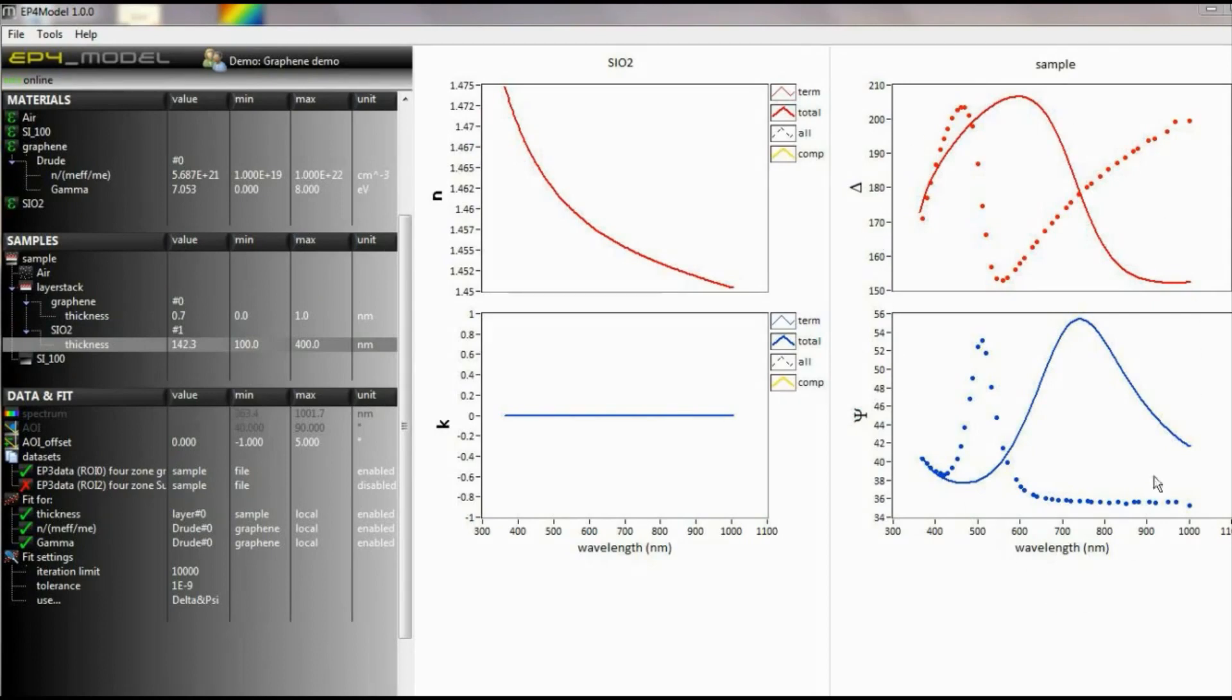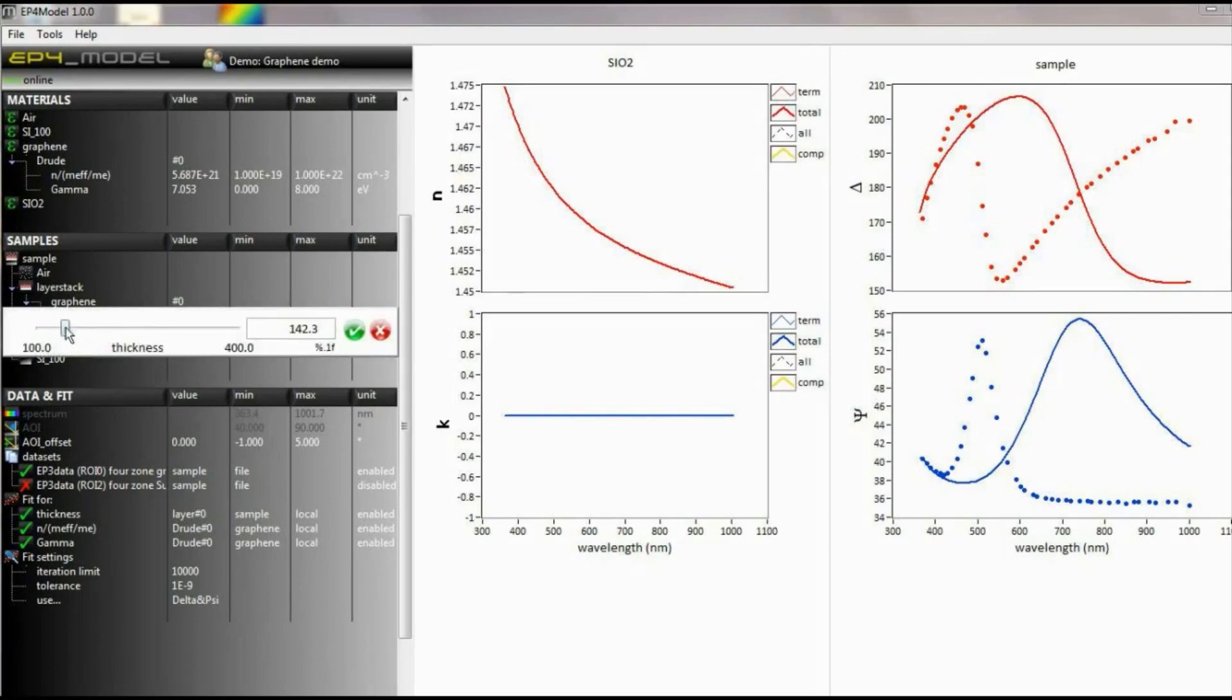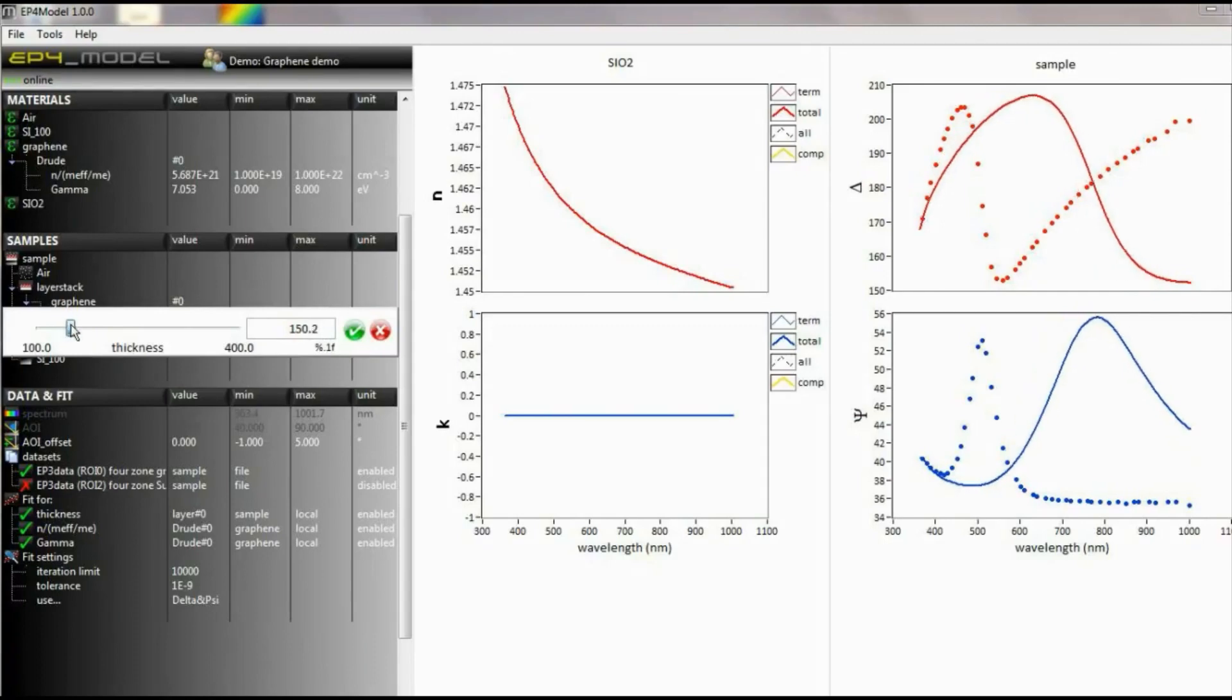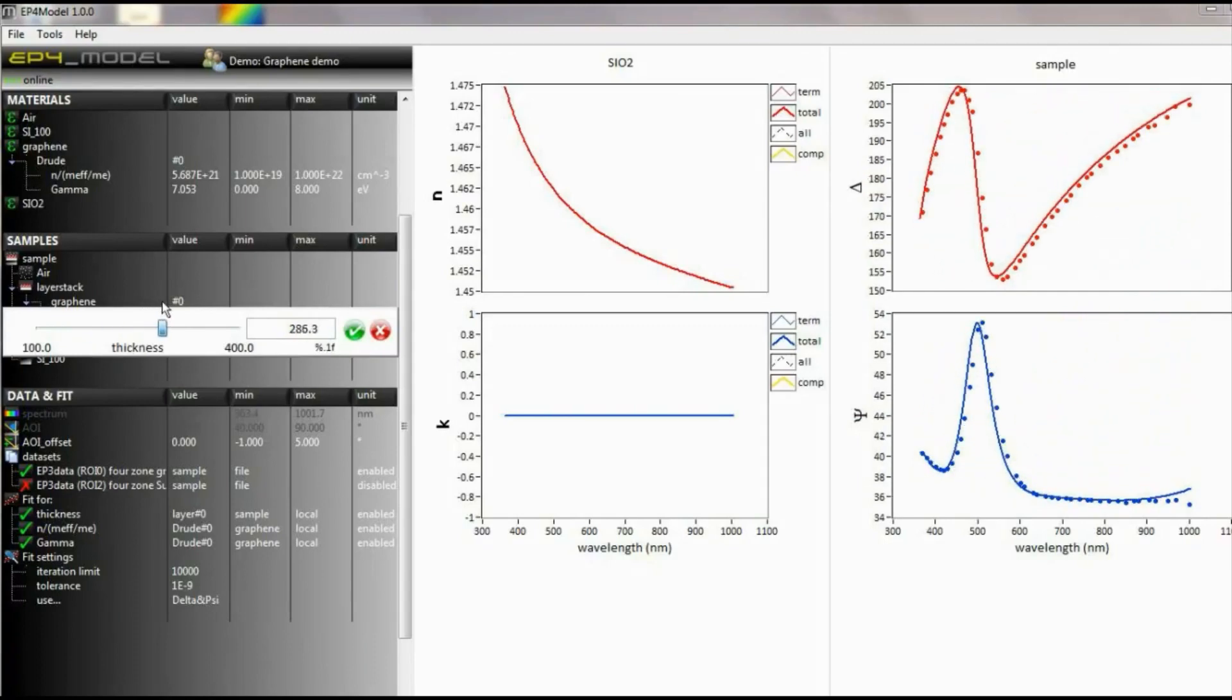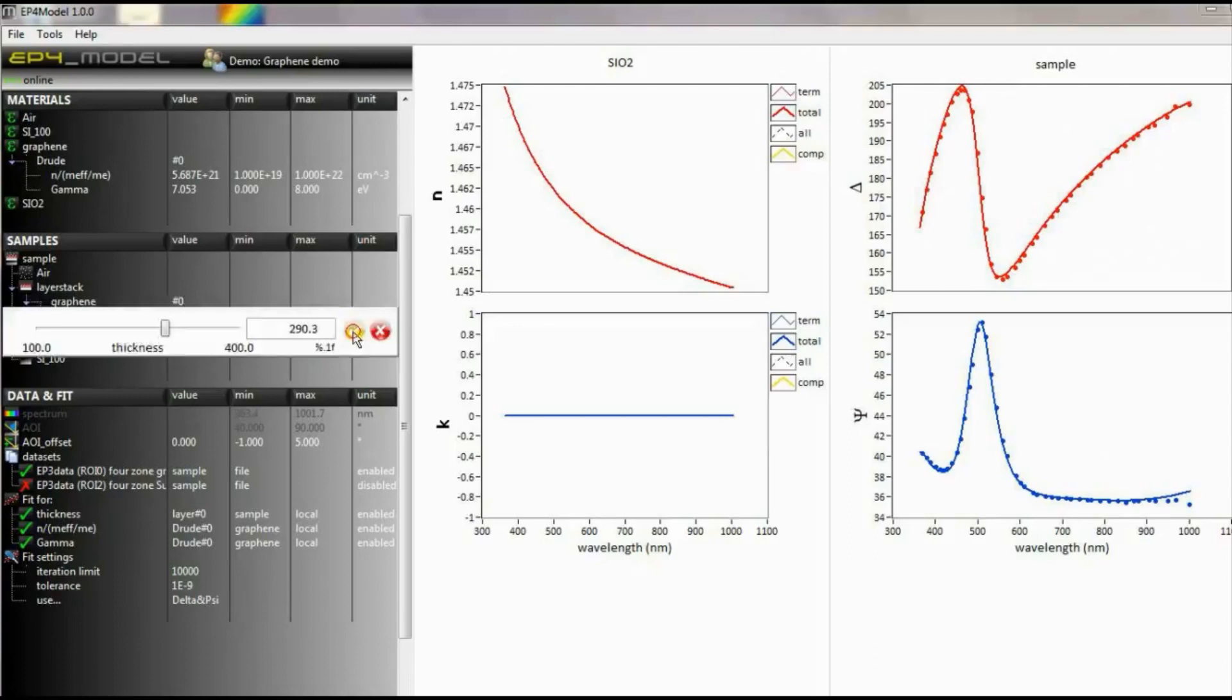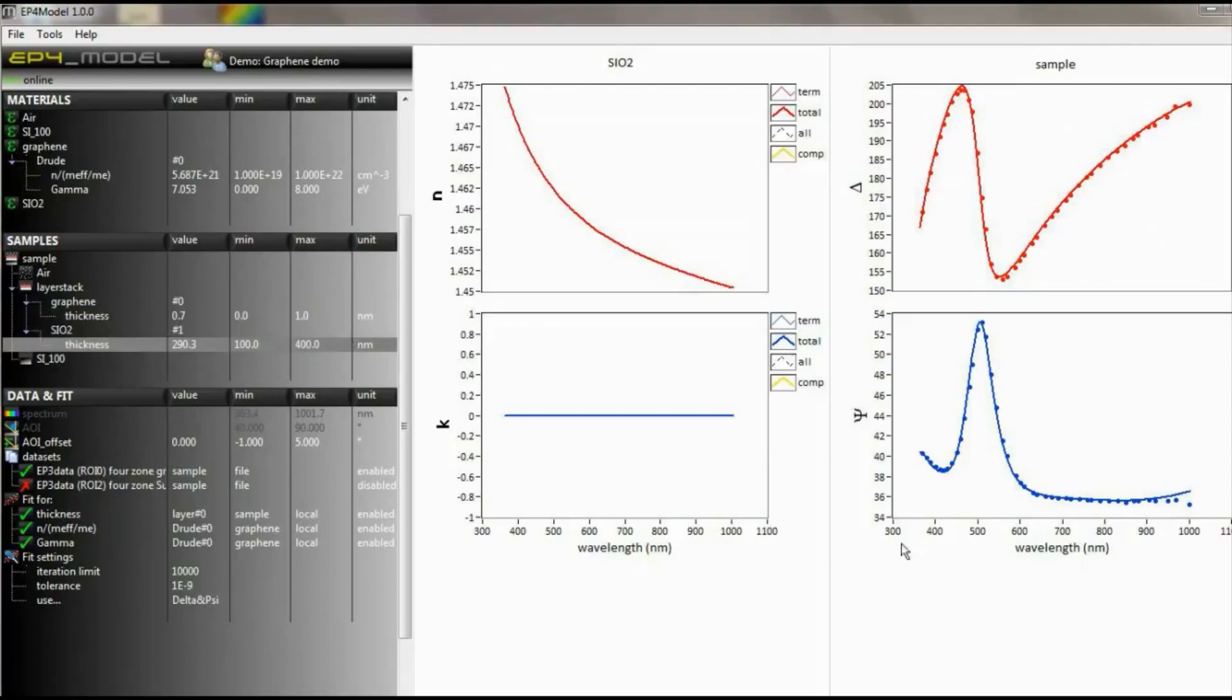As a layer is defined, the simulated delta and psi are displayed on the right side. You may change parameters in the layer stack or material definition to see an online change in the delta and psi functions. This allows you to visually fit the material to your data without starting a fitting calculation.